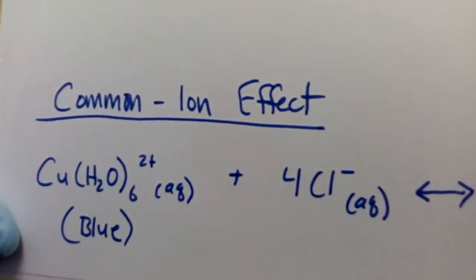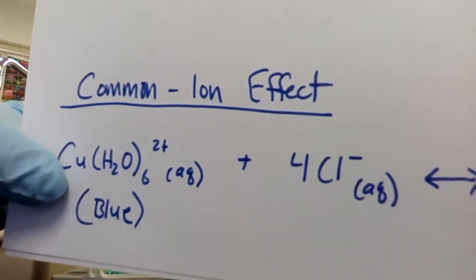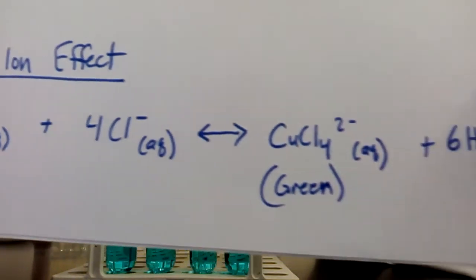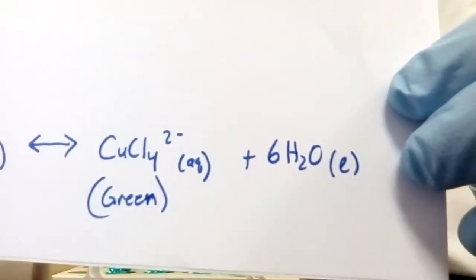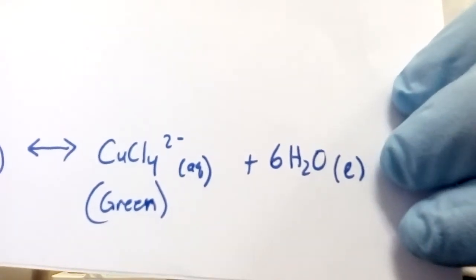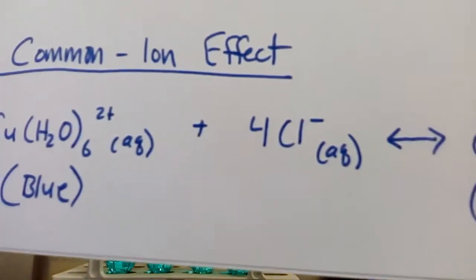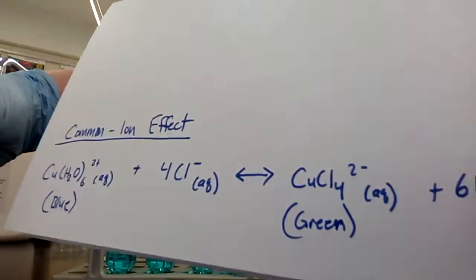And what we have here is copper chloride and it's hydrated with water. You can see copper there and water. This is more blue. When that's mixed with the chloride, it's going to form copper chloride, which is more of a green color, and water. So it's a type of dissolving reaction. And since we have a color change, blue to green, it'll be a little bit more obvious which way the reaction is moving.